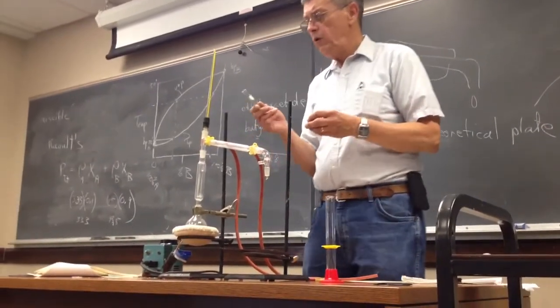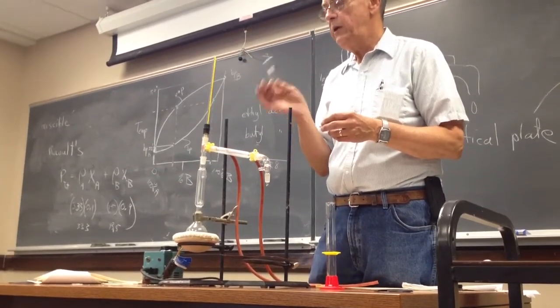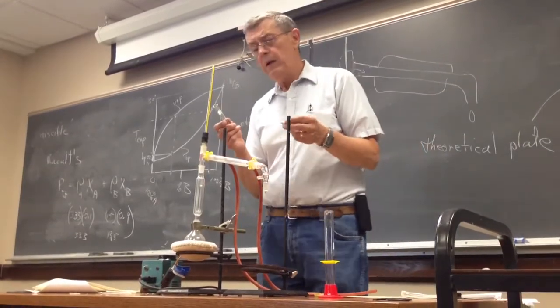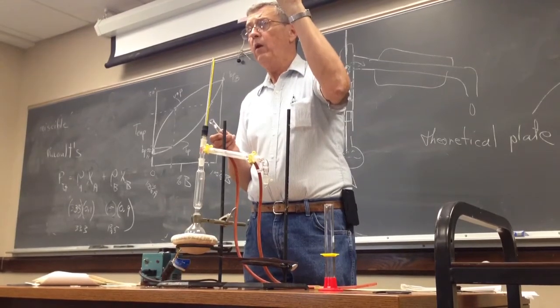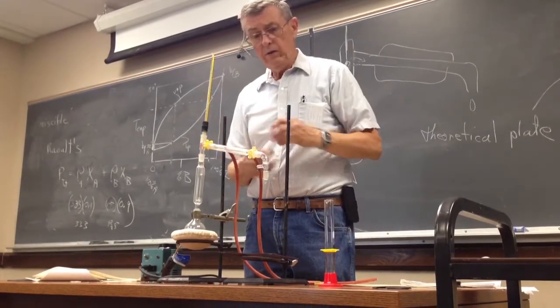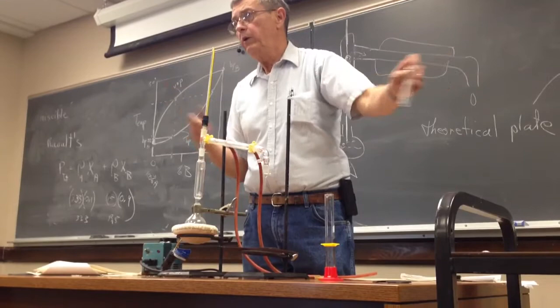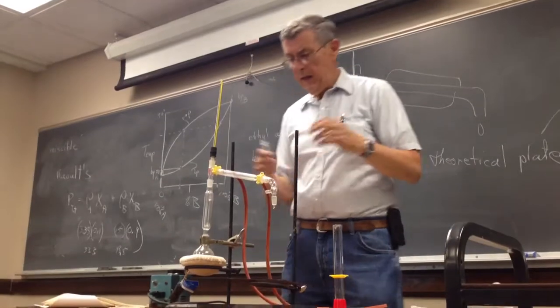I'll now get my test tube. By the way, you're going to need these. This is what we'll analyze the solutions on the GC. You don't want them to evaporate because it'll probably be the following week before you get to analyze it. So it's got to be corked. Corks are porous, and therefore we've got aluminum foil on the bottom of the cork to seal it. And then at the end of the distillation, all those test tubes with your name on the beaker go in a beaker in the refrigerator, and then you come back when you're going to do the GC analysis of it. Okay? So we got that all set up, and it's running.